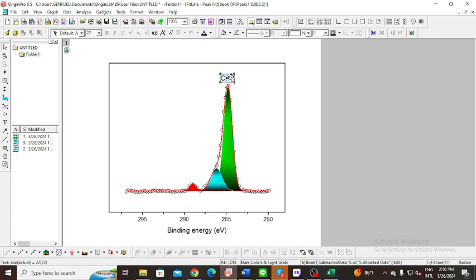If you also want to add something like an arrow, for example for this one, because we cannot really put it in the middle one, just copy and paste and go here. I get the idea. The result depends on what sample you want to make, and usually we also make the name here, what kind of analysis.